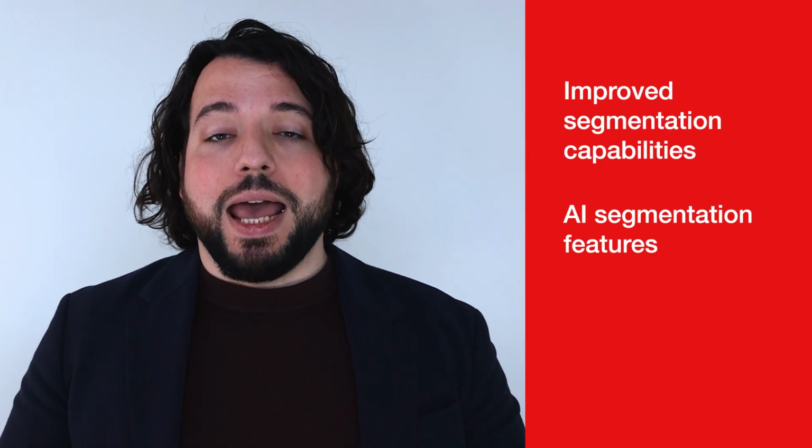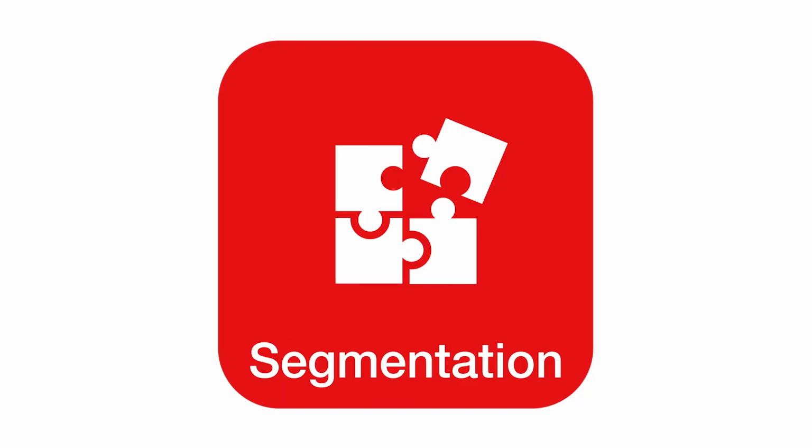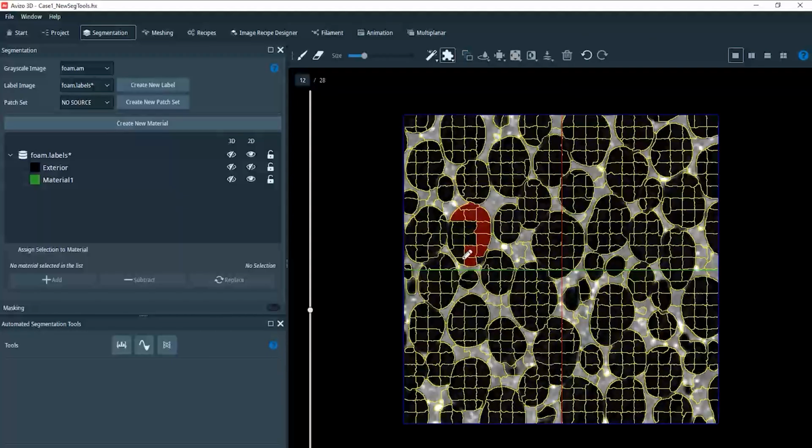I would like to tell you something about how we designed our Segmentation Plus workroom in Avizo and Amira software. We based our design on 3 different areas: improved segmentation capabilities, more AI, and protecting your flow while performing your segmentation. Firstly, we upgraded our most popular segmentation tools to speed up your workflow. The new lasso detects edges between interfaces and follows the curvature of materials with the new spline feature. We also introduced the SuperPixel, which speeds up the selection of materials in samples with numerous phases.